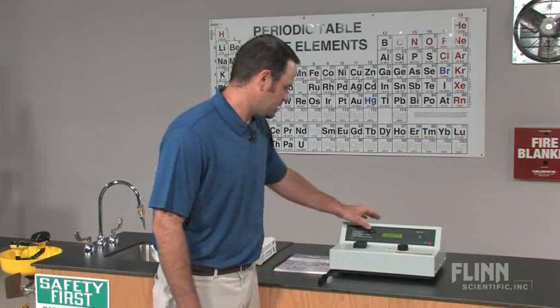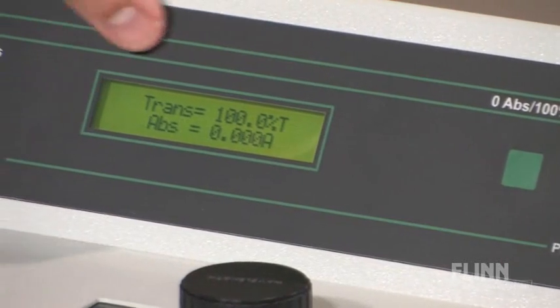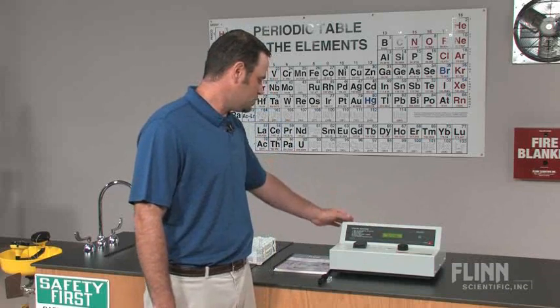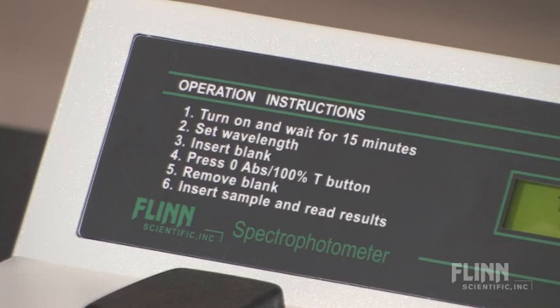It also has a large LCD screen displaying the transmittance and absorbance at the same time. It has easy to use operating instructions printed on the unit itself.